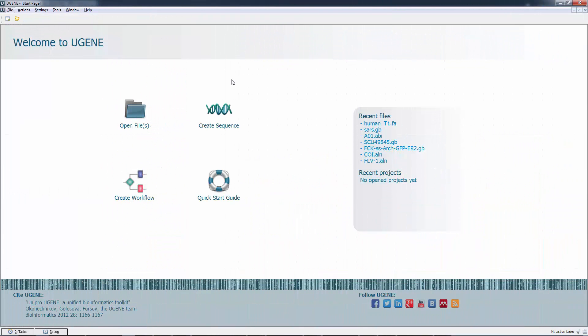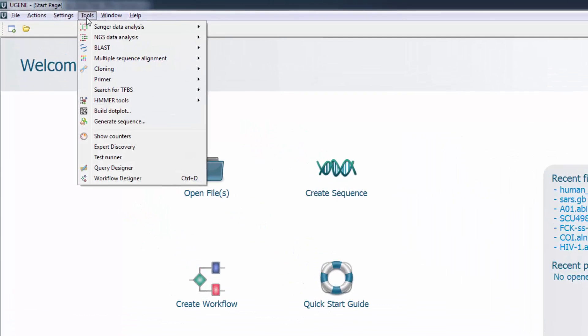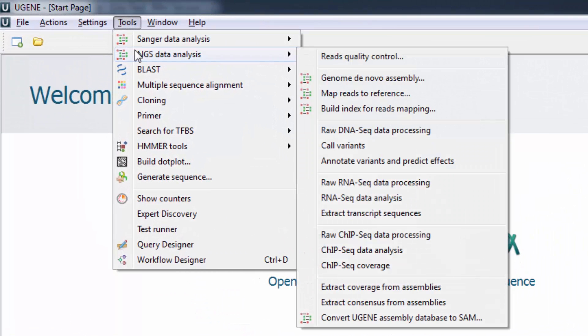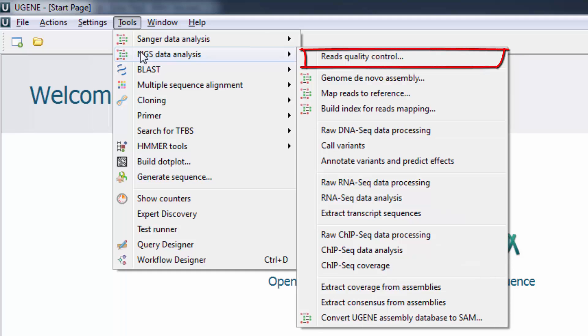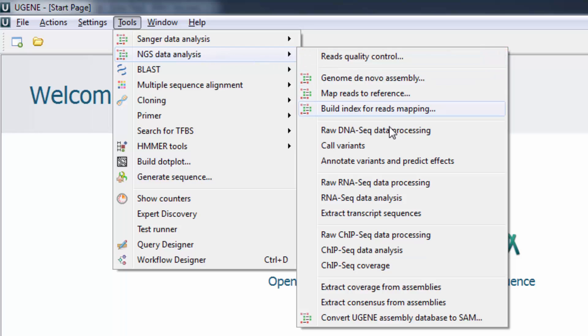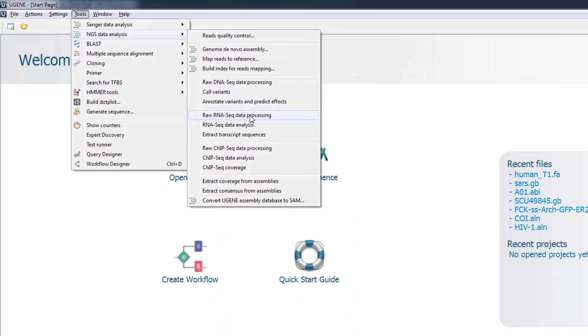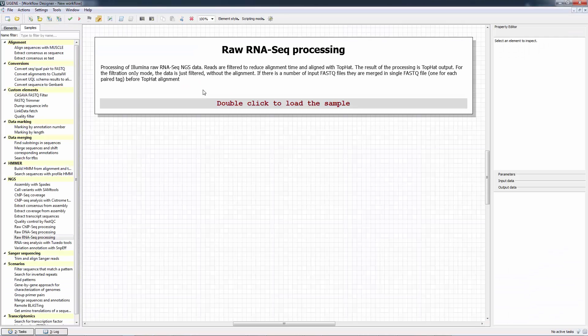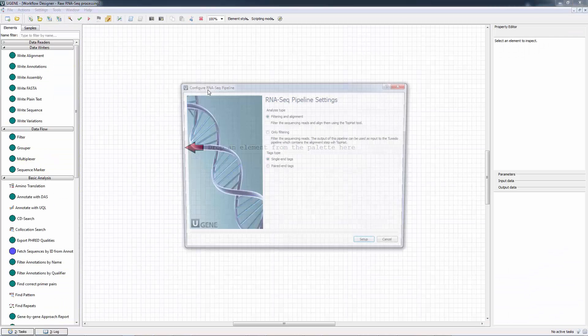Eugene facilities for analysis of next-generation sequencing data were also expanded. Particularly, the FastQC tool for quality control of high-throughput sequence data was added into Eugene. The tool was added to the raw NGS data analysis workflows as well.